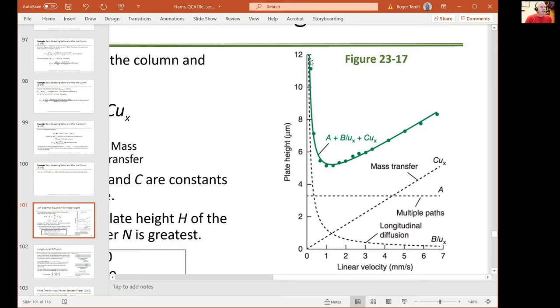You know, we just need a kick-ass plumber to come around and make us a leak-free HPLC that can operate right around down here, right? We just got to go up here just a couple of little bits and we say, okay, we're done. We've hit our optimum, right? And then we can scale back on the pumping rate a little bit and get down here. But for HPLC, we are still up here somewhere. Does that make sense, Casey?